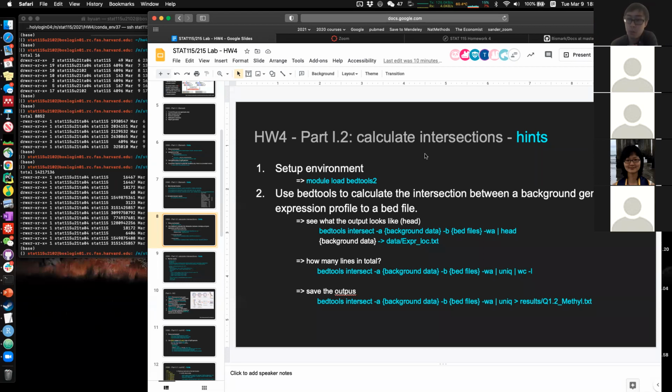Now what we want to check is, do we have a lower gene expression if we have more frequent methylation events? Because that's the hypothesis here. If you have methylation, through the chromatin regulation mechanism, you would in general have lower gene expression levels. We also put in some positive controls: wherever you have these histone modifier proteins, those enzymes, you would also be able to see some upregulated gene expression.